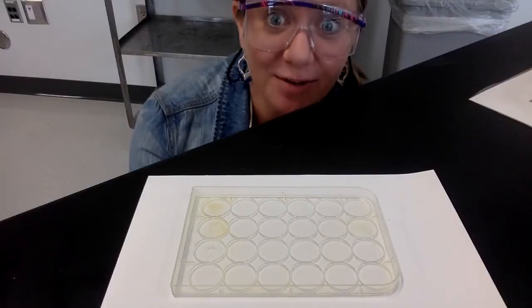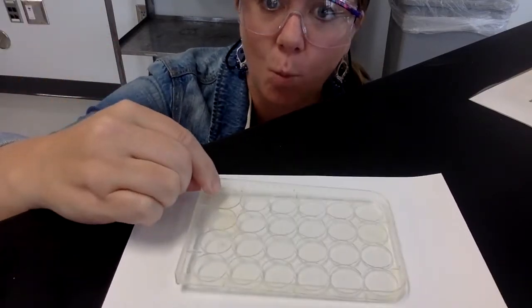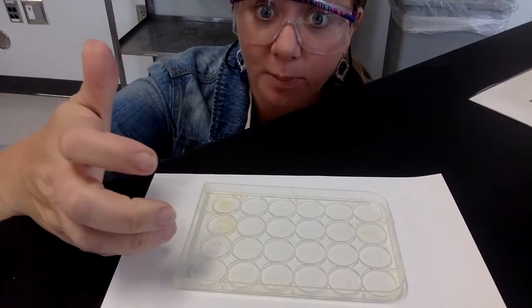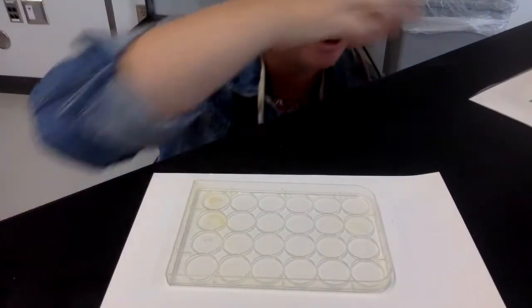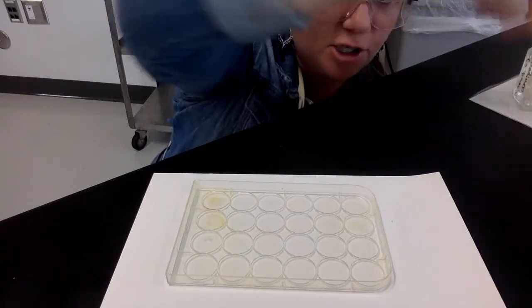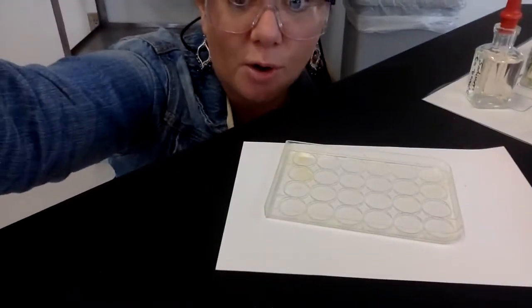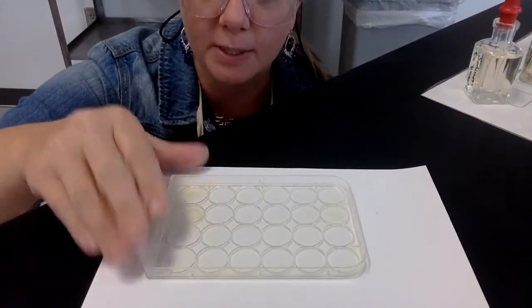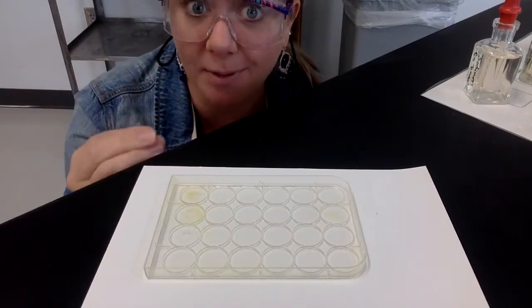Okay, so now you're ready to start taking data. What you can see is I have a close-up on something called a well plate. A well plate is like a plate that has little wells in it where I can mix the chemicals together. The chemicals are in little dropper bottles and they're labeled so that I can use those to show you the different precipitates. So again, you're following along on your lab handout and we're going to mix the chemicals that it says.